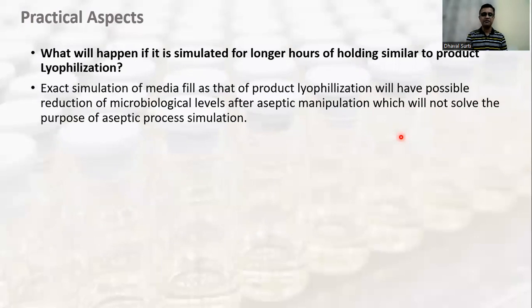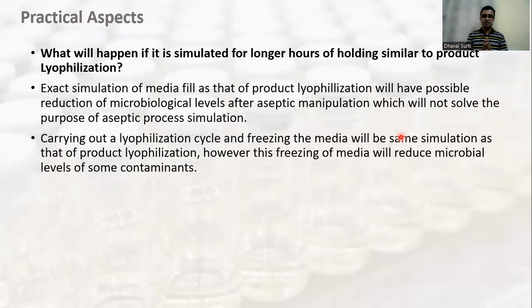What will happen? Exact simulation of media fill as that of product lyophilization will have possible reduction of microbiological levels after aseptic manipulation, which will not solve the purpose of aseptic simulation. So understand, lyophilization will have possible reduction of microbiological levels after aseptic manipulation. Then carrying out the lyophilization cycle and freezing the media will be the same simulation as that of product lyophilization.